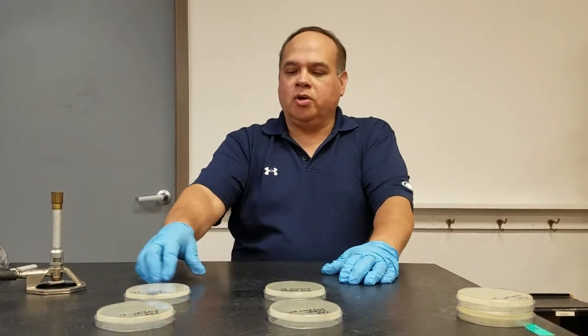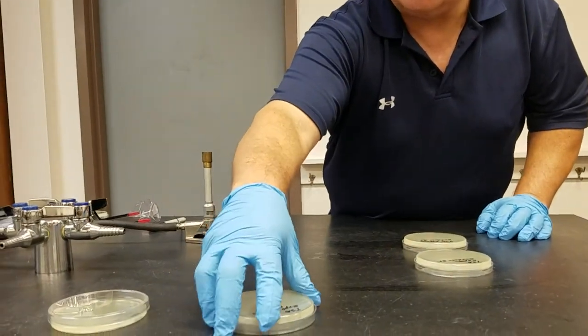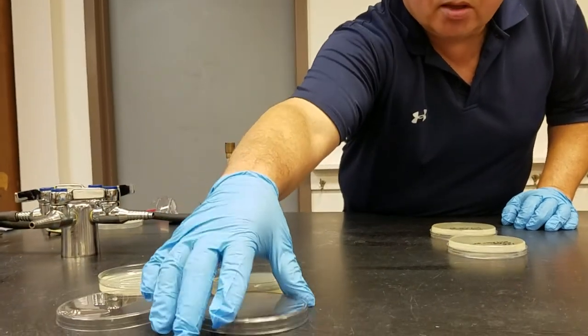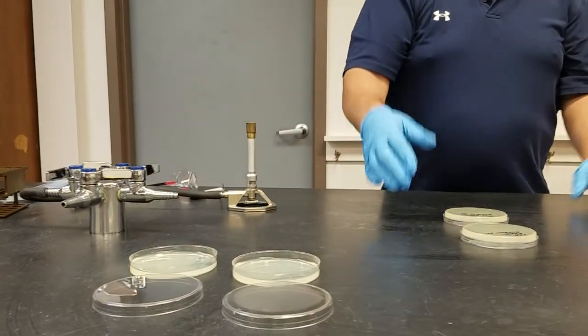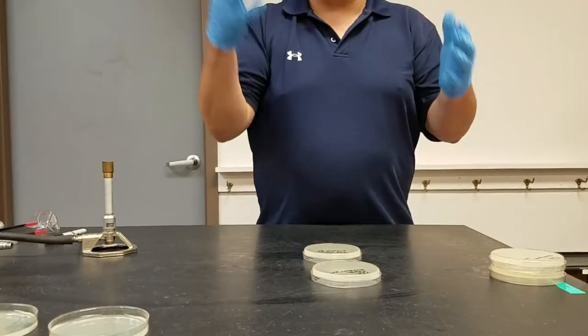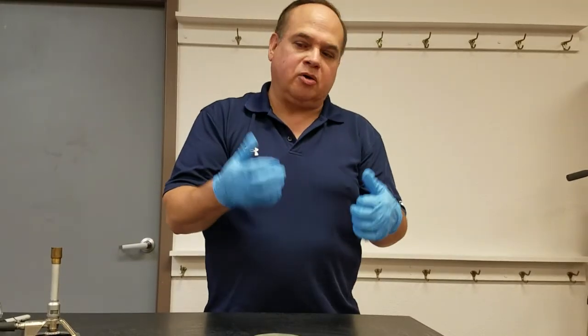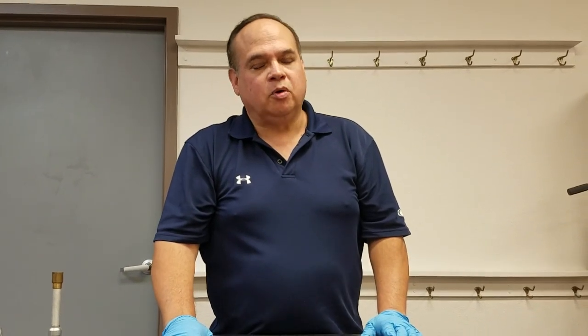I'm going to take these plates and open them up to the indoor environment and leave them there for about 20 minutes or so. Everything that's in here will be captured — these are really sensitive to anything alive. Any microorganism that lands on it will grow. You won't be able to see viruses, but you will see yeast, mold, bacteria, and some other organisms.